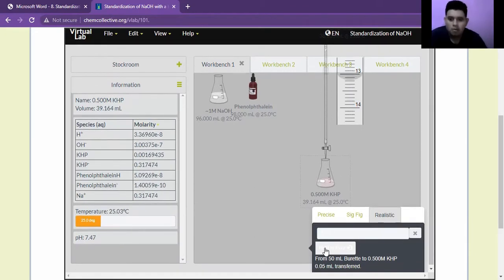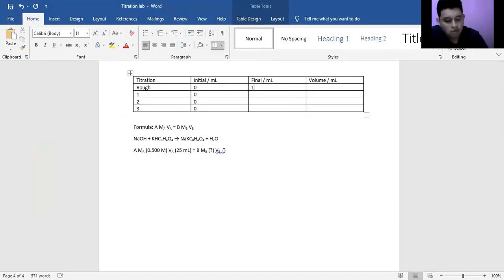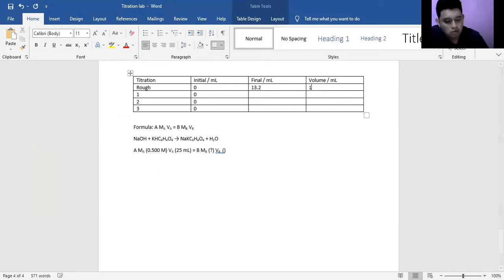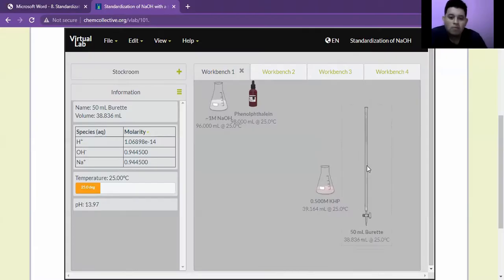There, here it is, the final volume 13.2. Therefore, our volume, if we initiate it at zero, it's going to be 13.2. Therefore, we must do this experiment three more times and record the volumes.